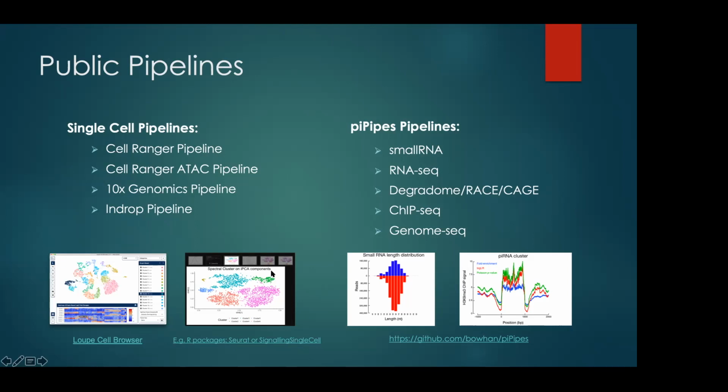data. And if you are interested in piRNAs, you can use these PiPipes pipelines. These pipelines were created by Zamore Lab members. Again, we embedded this software in our tool, so people can execute the same software inside our system.